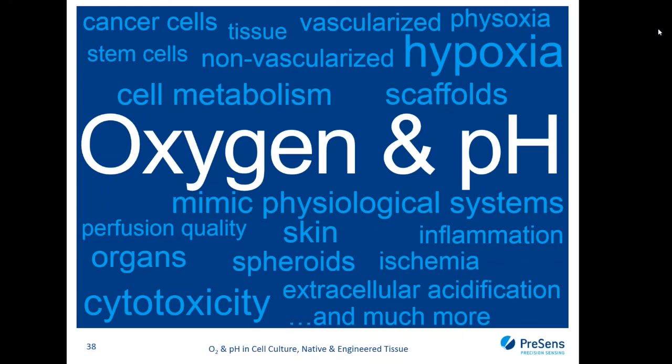You can, for example, use 1 minute of plasma treatment, or you can also use other substances for cell attachment facilitation, such as fibronectin or polylysine, or also FCS or BSA or media or extracellular medium. So you can cover the sensor foil with a very thin layer of these substances, and then the cells adhere very well to the sensor foil.